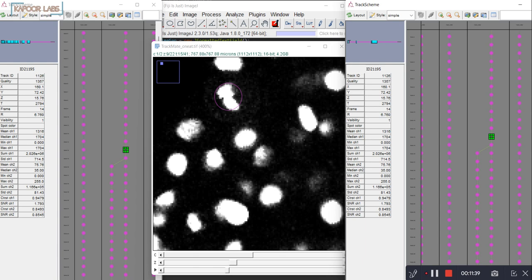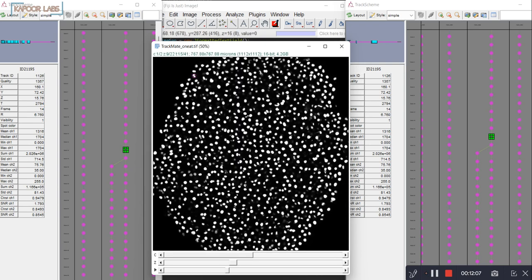So overall, my message here is that the track scheme that you get out of Oneat, even after you have erroneous linking of tracks in TrackMate, can be corrected by Oneat. And the overall goal of this whole project is to improve the accuracy by putting all these powerful algorithms together, combining the Python and Fiji worlds, to get optimal tracks out of the thousands of tracks which you will get. And this is just an example of a small data set. You will have much bigger data sets than this, and I want Oneat to be able to correct those lineage trees. And for this you need properly trained Oneat models, and for this you need training data.